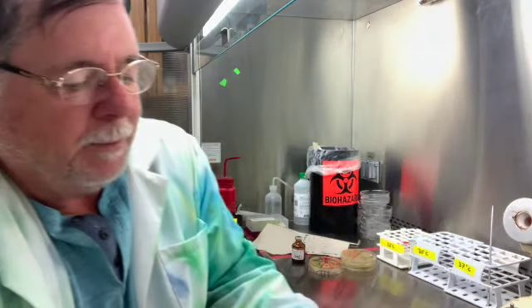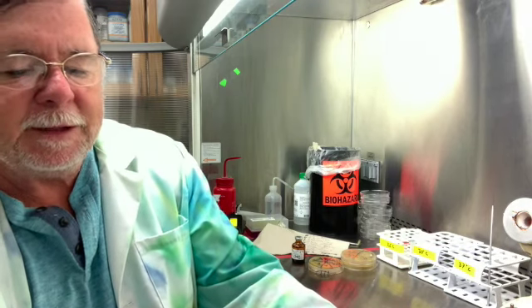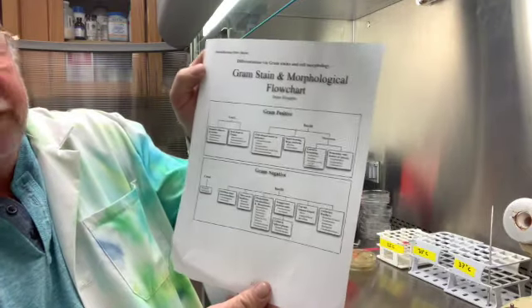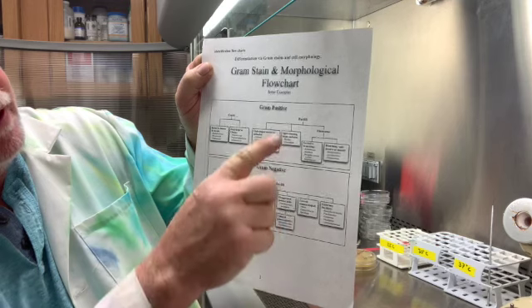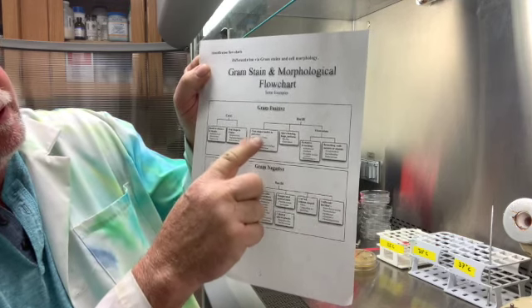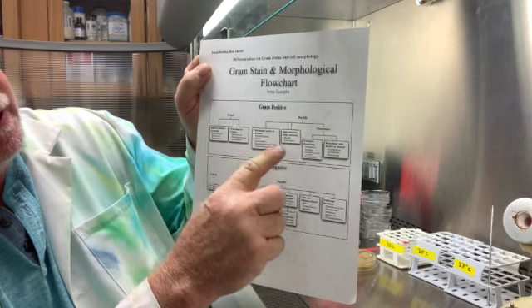Okay, so next chart around that 74 to 77 area is this chart here, gram-positive. And so, we had a gram-positive bacilli. You look at some of the characteristics of the cell shape. So was it club shape? No, it didn't look like it.